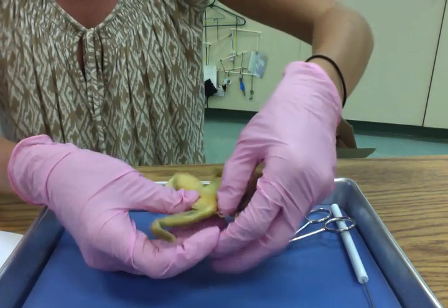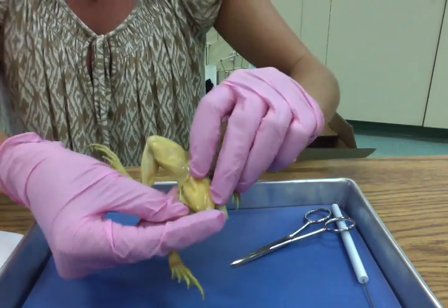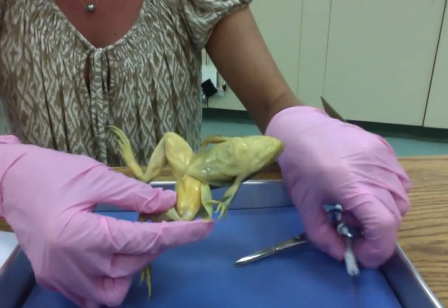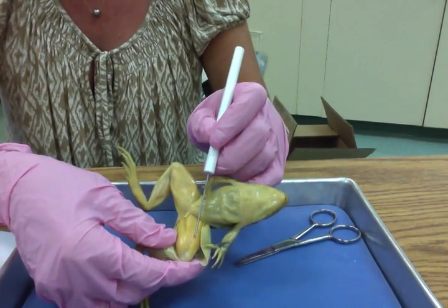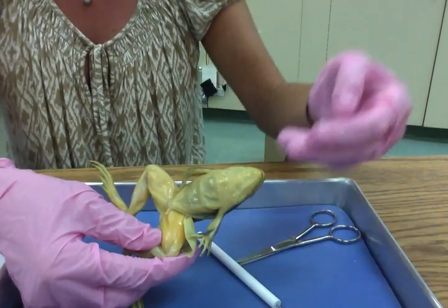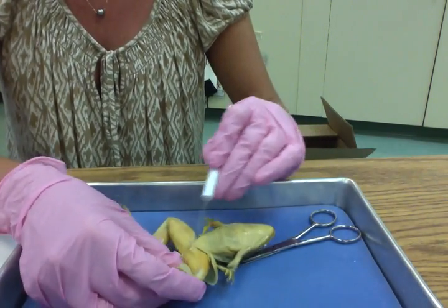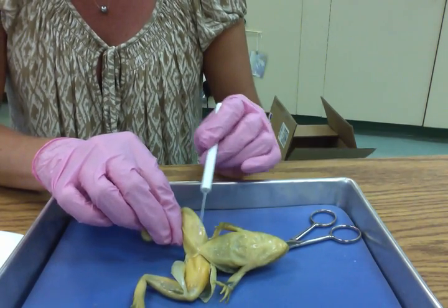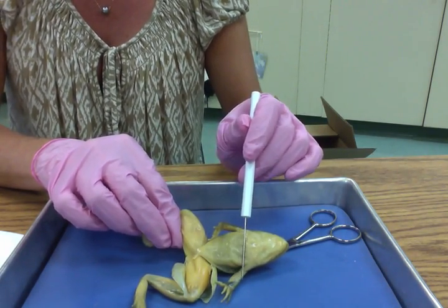And then you can pull away the skin on either side. What you're doing is exposing the frog's hind limb muscle. There's not a whole lot to see other than this huge muscle, right? So you can poke it, feel how firm it is. That muscle is what gives the frog the ability to make those giant leaps that it makes, right? We all know that frogs can jump pretty high thanks to these strong leg muscles back here. So that would be the most obvious difference between the hind limbs and the forelimbs. If we were to cut up here, we wouldn't see quite as large of a muscle.